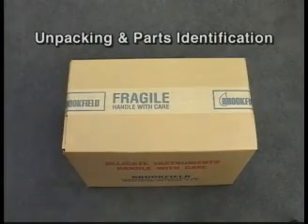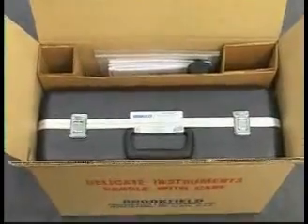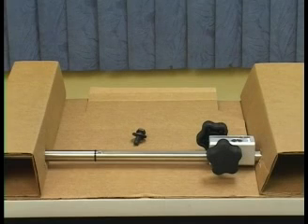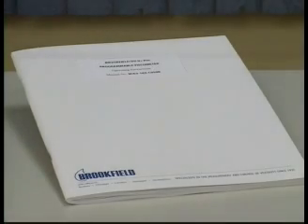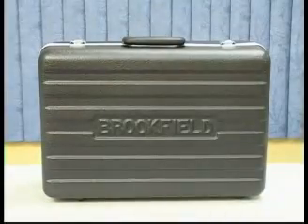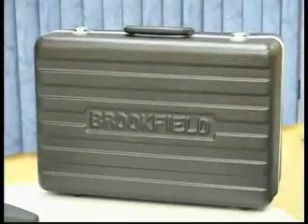Unpacking and parts identification. Open the box. Its contents should include a lab stand rod with clamp assembly already attached, and a locking screw to secure the rod to the lab stand base, operator manual, a small box which contains your lab stand base with leveling screws, and a large black carrying case. Please make sure you have all of these components before throwing away any packing materials.